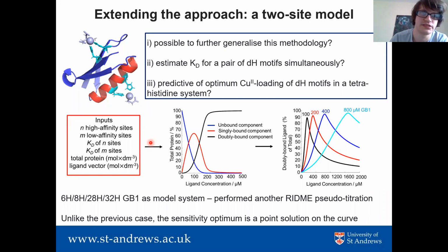I think this is really a function of the chelating agent. The way we normally do the spin labeling is that we introduce the copper already chelated.